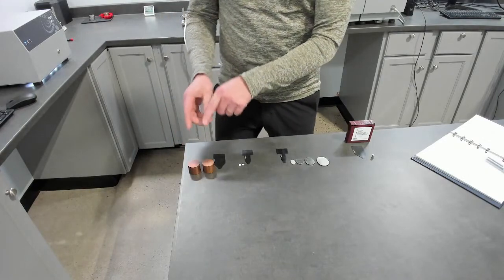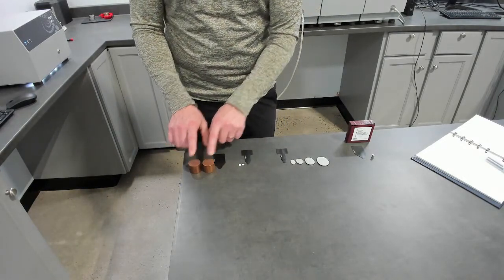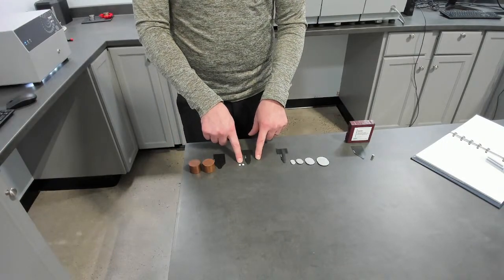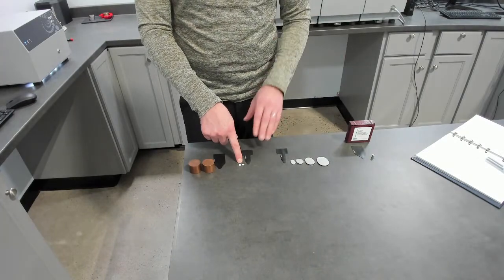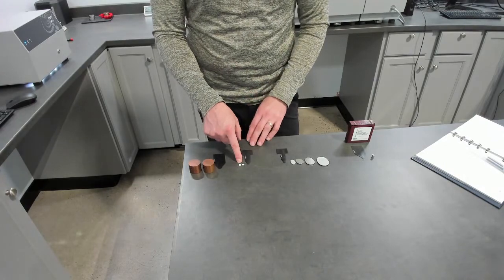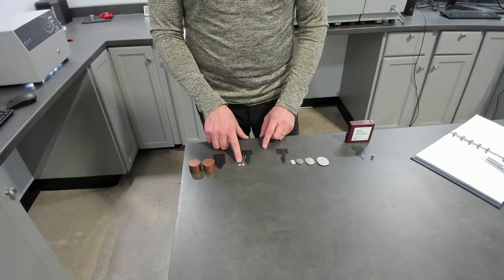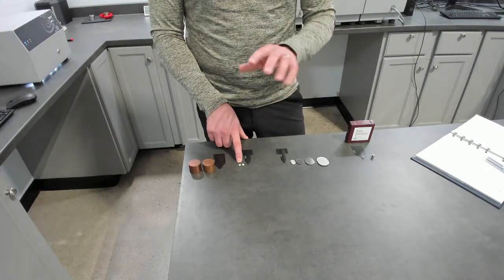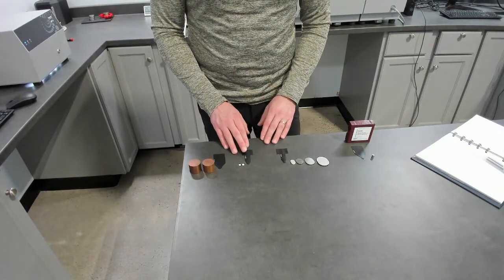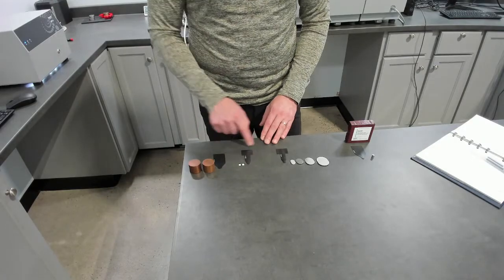So another, opposite end of the thermal conductivity range, these are around 400 watts per meter Kelvin. At the opposite end of the thermal conductivity range, this is Macor, small pieces of Macor, which are around 1.5 watts per meter Kelvin and around 0.7 millimeters squared per second for diffusivity. These are 5 millimeters square by approximately 1.5 millimeters thick, so very small, on the lower side of thermal conductivity. And we're measuring this with the bulk module.